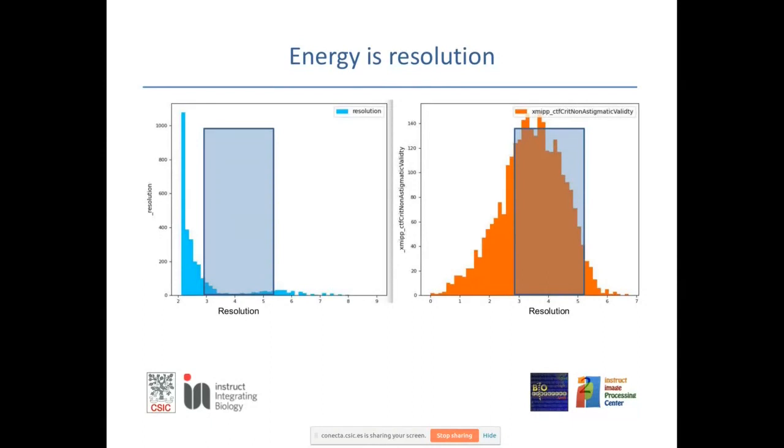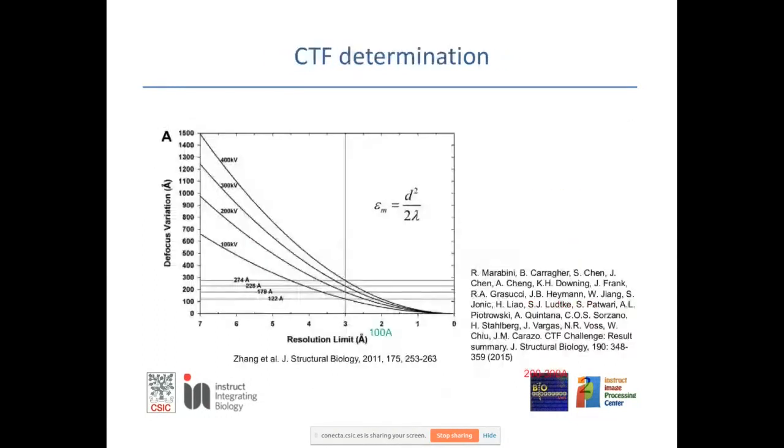And so the fact that you have energy at high frequency doesn't mean that you will be able to have a 3D reconstruction at that high resolution, because all programs will assume that things are non-astigmatic, and the astigmatism may play a role.